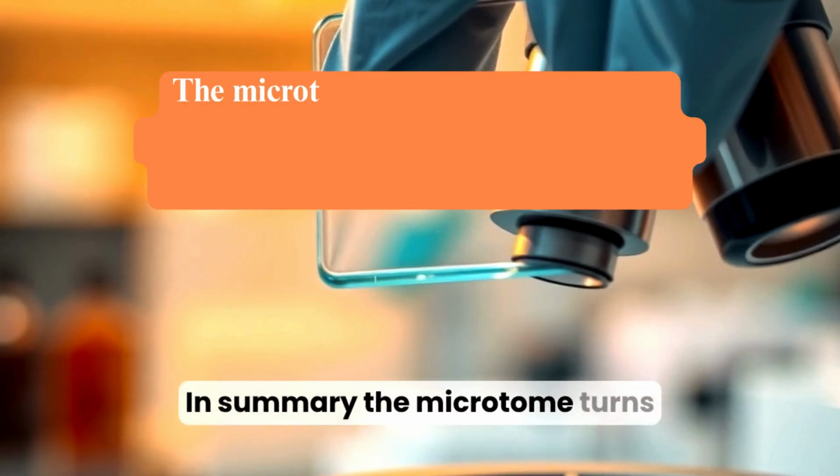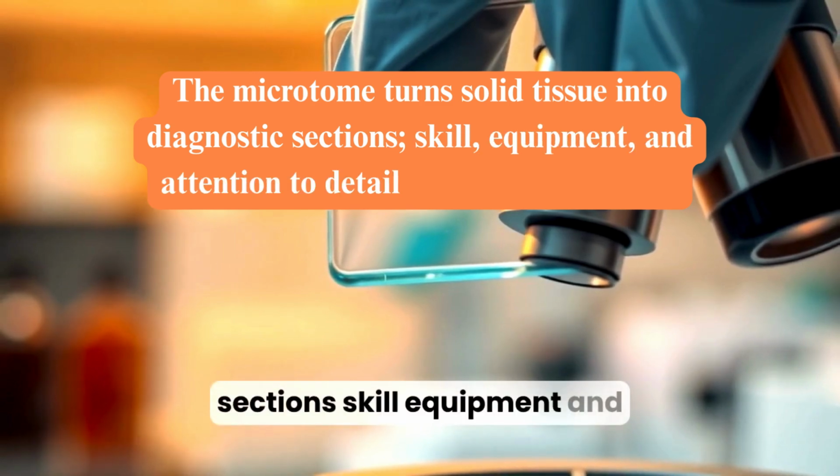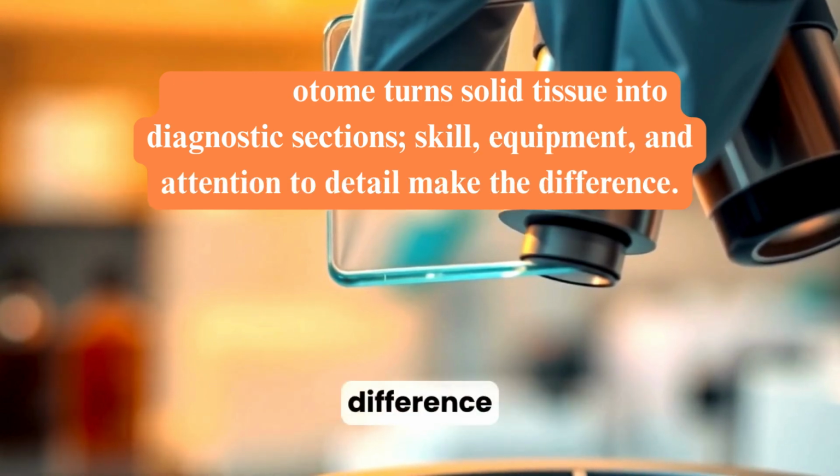In summary, the microtome turns solid tissue into diagnostic sections. Skill, equipment, and attention to detail make the difference.